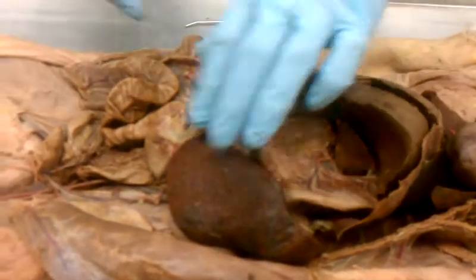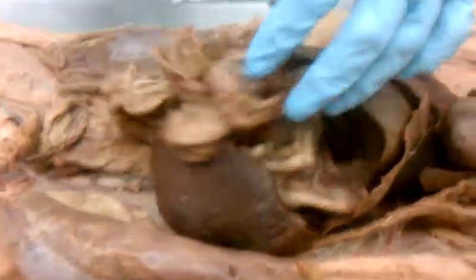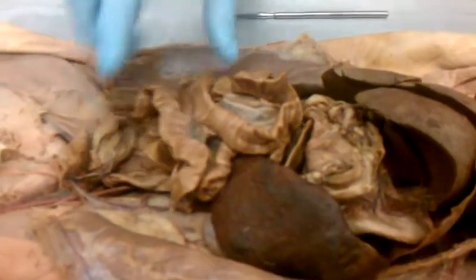Okay, then the intestinal glands. Where do you think those are? Right here. That's all the intestinal glands. They're in there.